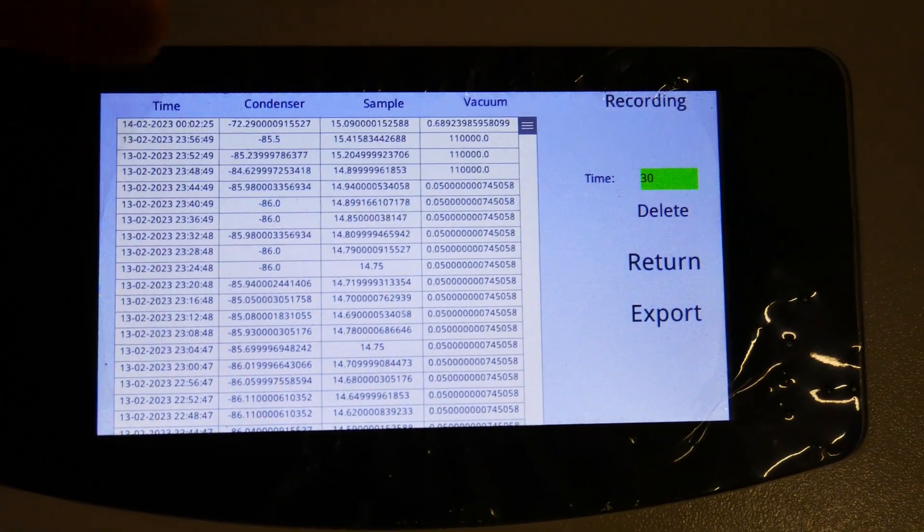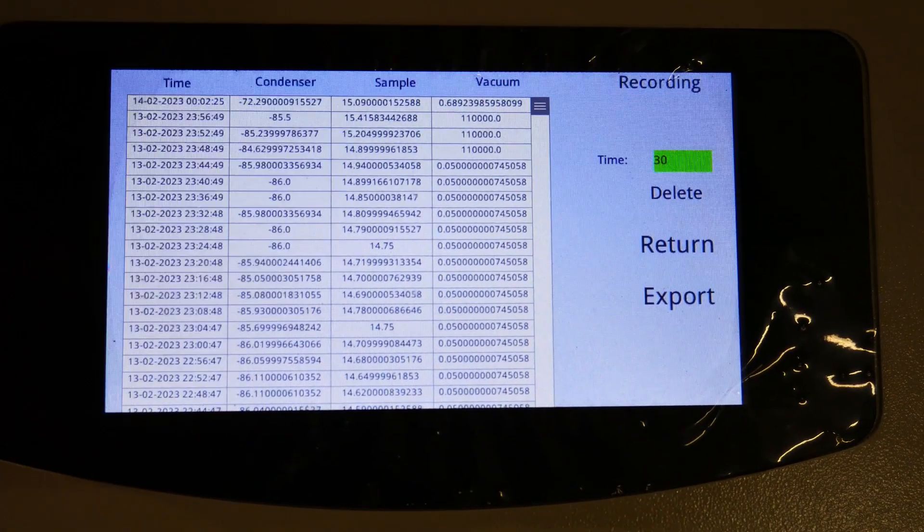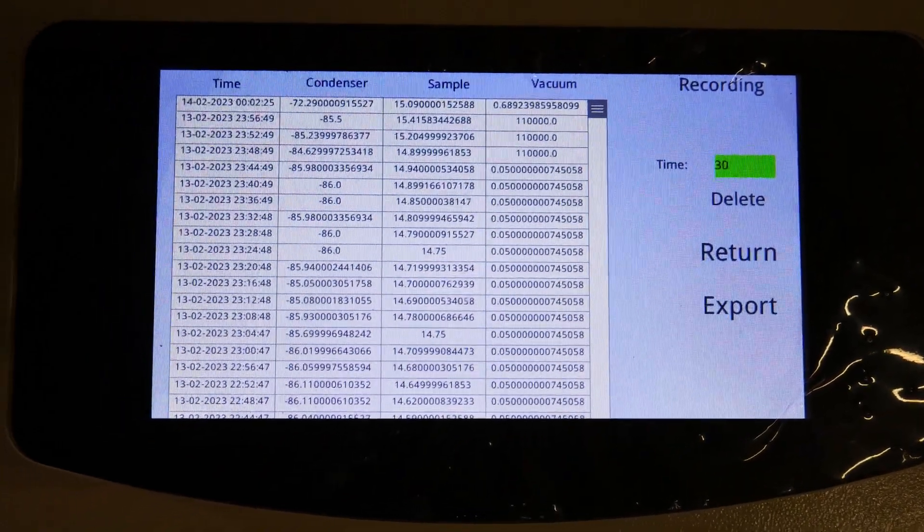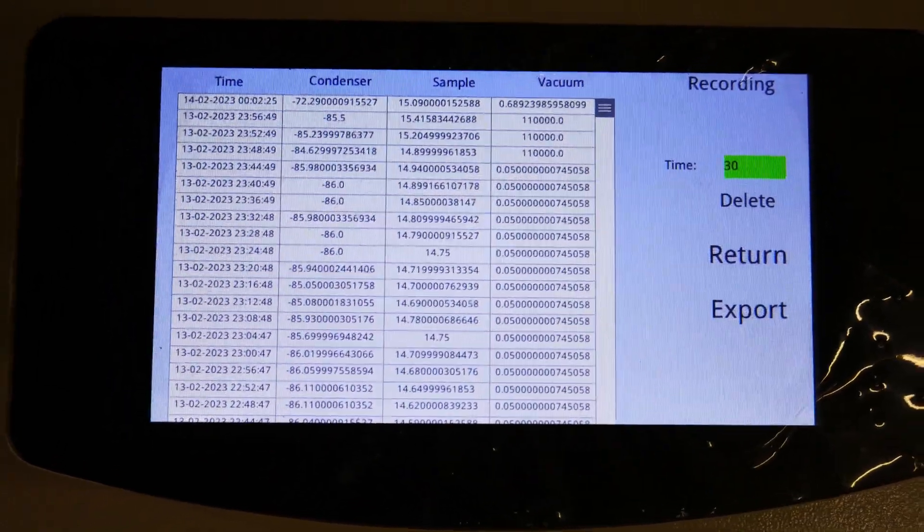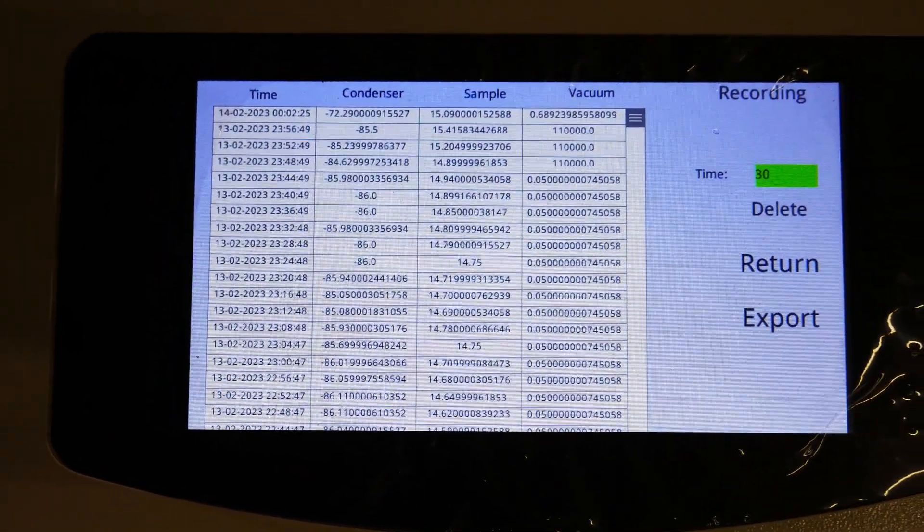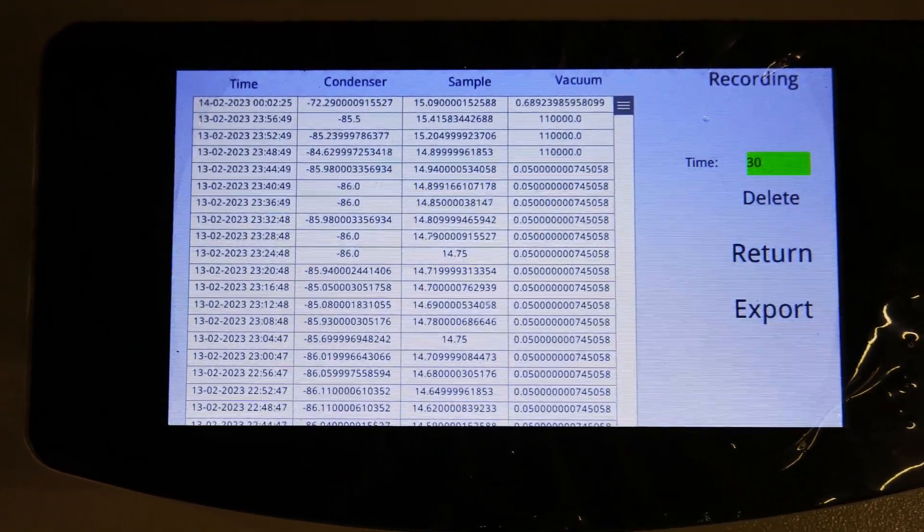If you want to see if your sample is done, all you have to do is look at the temperature and what you set it to be, such as room temperature. That shows you exactly when you need to turn it off and take the samples out. There are a lot of advantages to the SharpFreeze system.